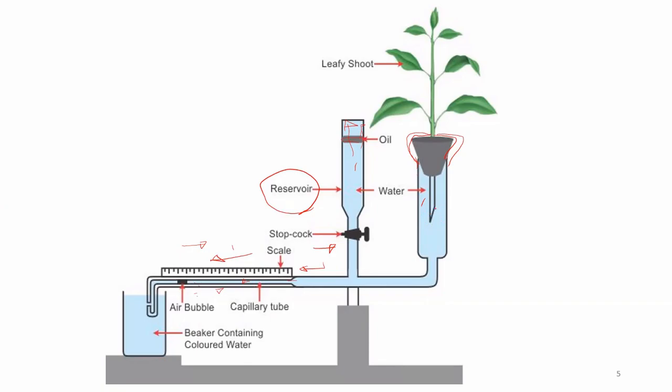So it can survive in fresh form only for some time. If the shoot is not fresh, the cells go into a dying stage, which means no metabolism occurs. Transpiration is one of the metabolic processes, so the transpiration rate will be reduced.